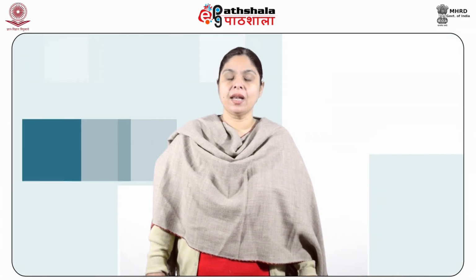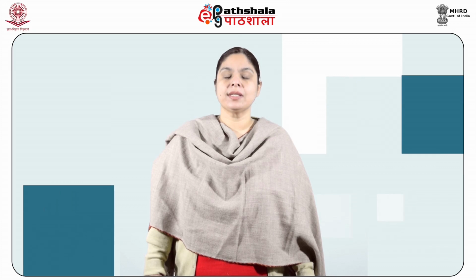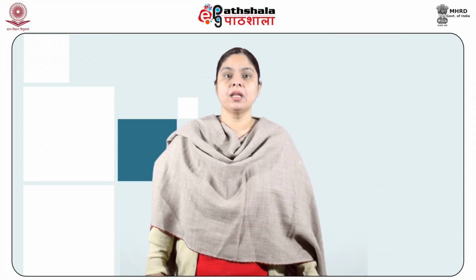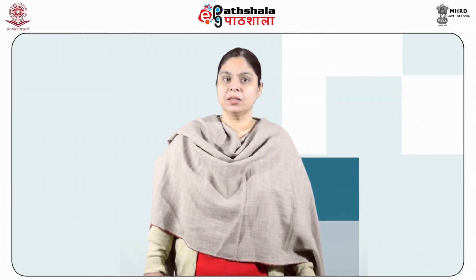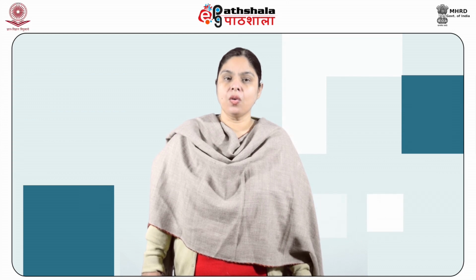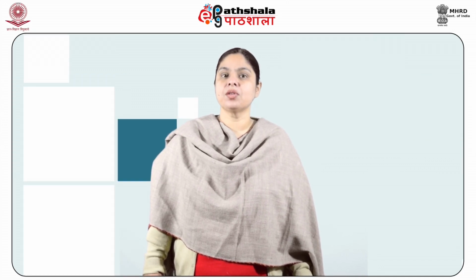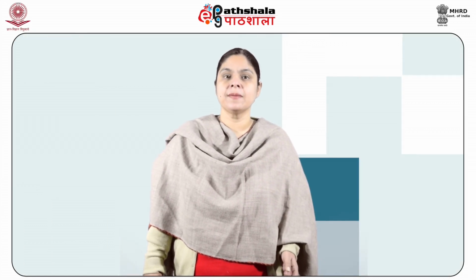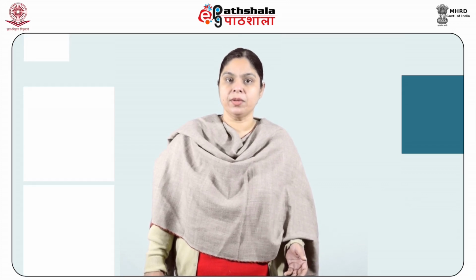Now, a thorough analysis is then required to determine whether the two soil samples, that is the one which we obtain from the crime scene and the other which we obtain from either the tire of the vehicles or the suspect's shoes, belong to the same origin or not. For this, methods like density gradient and observing some of the physical characteristics are very common.